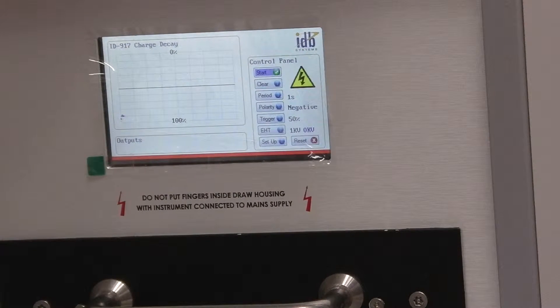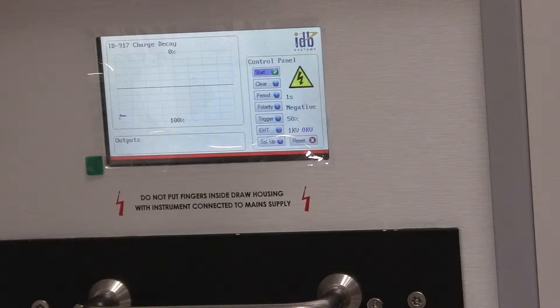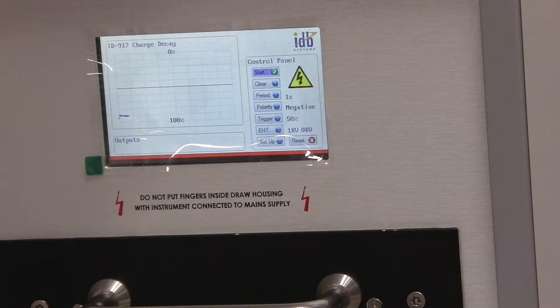That's interesting. After an initial discharge period it's planned out. What might have happened there is that the sample already had a significant charge level on it — of the opposite polarity to that which we've applied. But now it's flat lined.